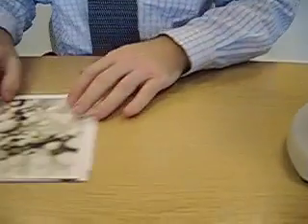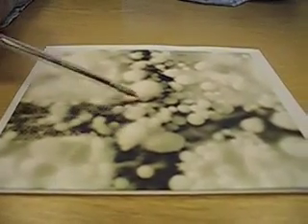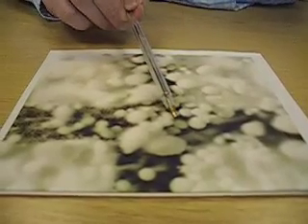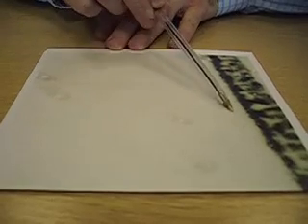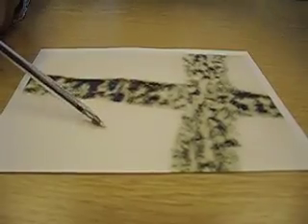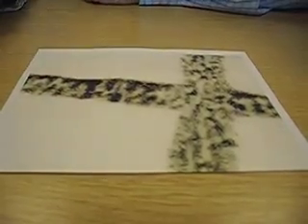We've taken three slides here. The first was taken from within the wash tank, and it's exactly what we'd expect to see — very high levels of Magnesol, very consistent particle size, as discussed earlier. The next sample was taken after the wash, and as you can see, very few production residues and impurities, with just a few small speckles of magnesium silicate still present. After the final polish stage, it is very clean indeed. This is the grid line we discussed earlier, and as you can see, there are no traces of impurity.